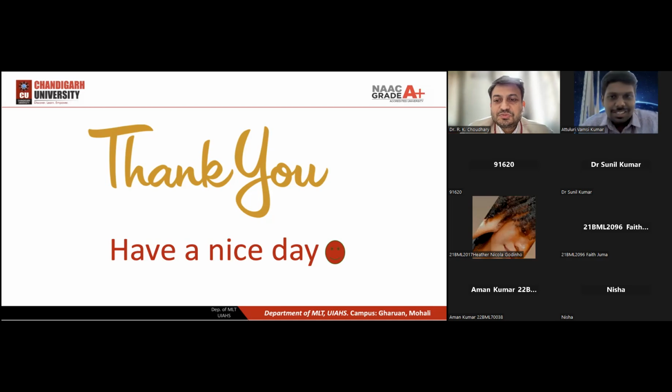Actually, we already finished flow cytometry, sir. Students are already clear about forward scatter and side scatter applications. Yes, that's why in today's first lecture I chose just the basic things, because I have not covered the analysis part. Cell sorting is one of the big topics, and how to use it, so we can cover that in another lecture.